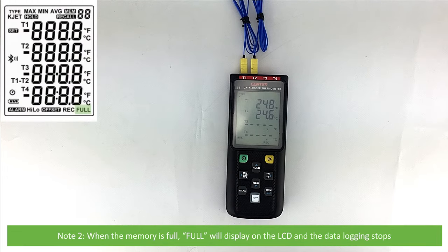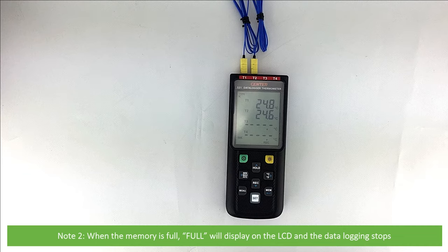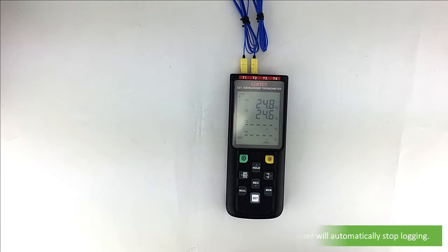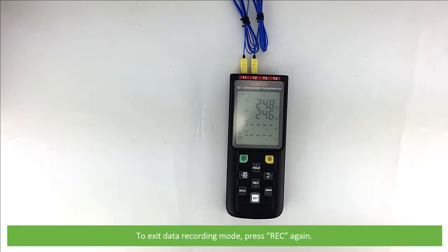When the memory is full, full will display on the LCD and data logging will stop. If the battery power is critically low or becomes low during recording, the meter will automatically stop logging. To exit data recording mode, press REC again.